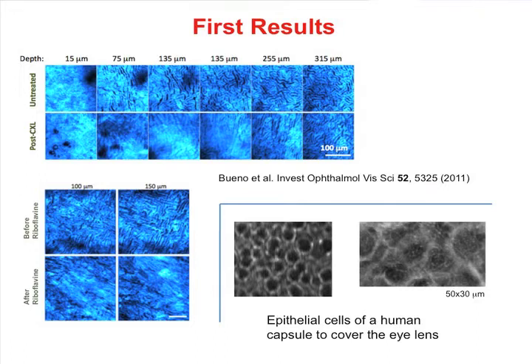The second harmonic generation images show changes in the anterior corneal stroma, like the turn of the regular collagen patterns into randomly distributed structures, and this might be a consequence of the corneal thickness decrease as a result of the riboflavin instillation.